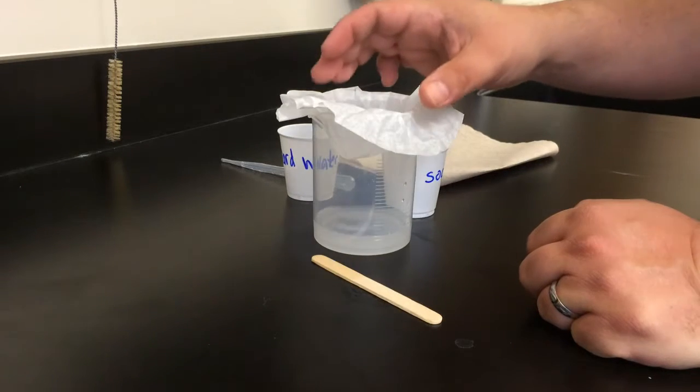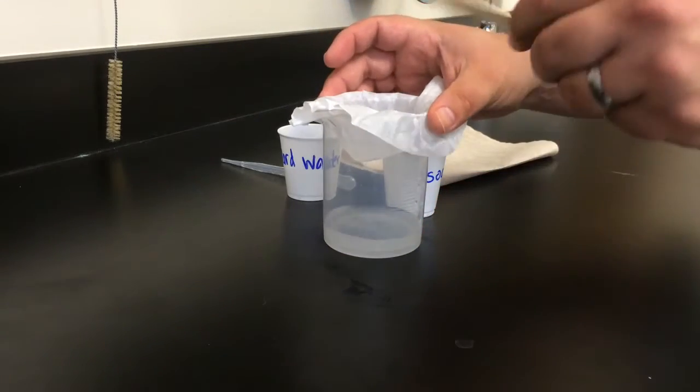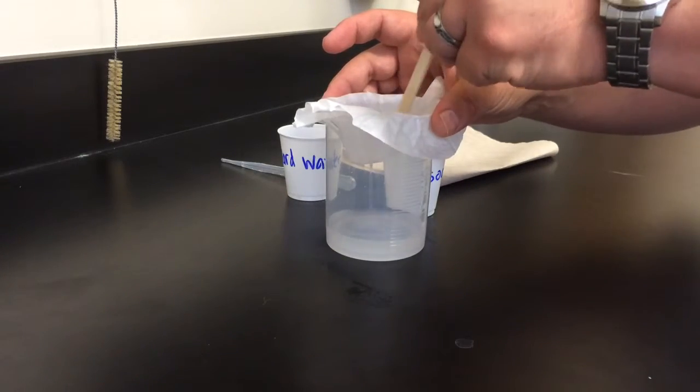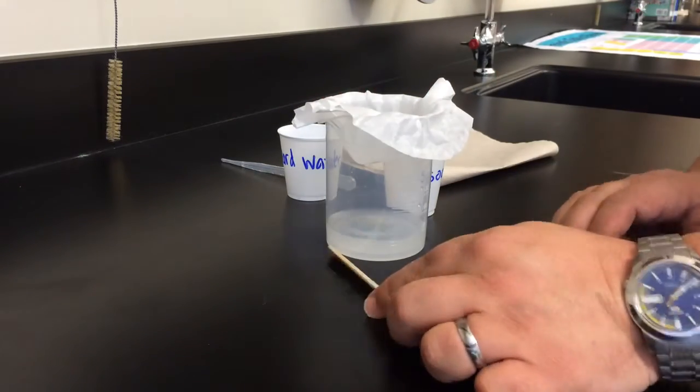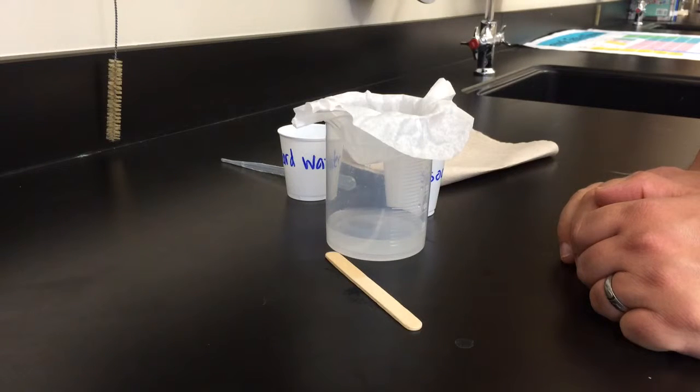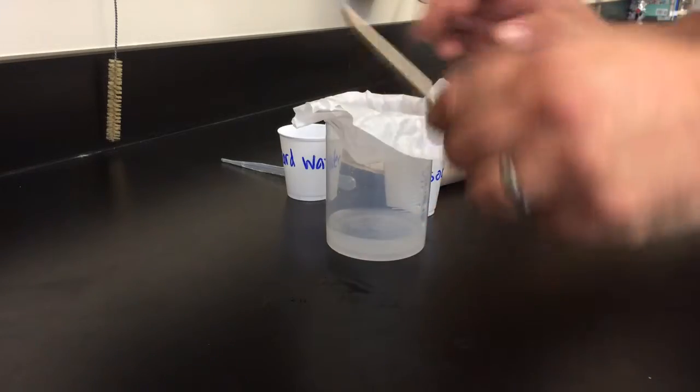And if I do it right, I'll end up with a whole lot of soap scum. Notice that I'm using the popsicle stick to move the liquid around up here. That helps it go through the filter but you want to make sure you don't put a hole in the filter because obviously that's going to make it hard to separate the soap scum from the water.